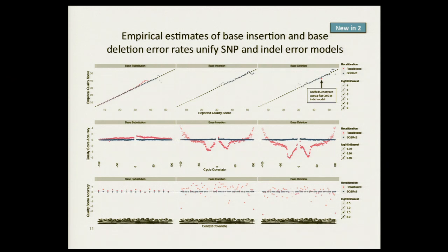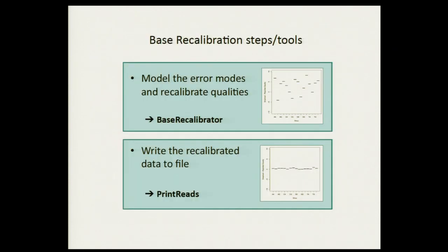Is everyone clear? Okay, so finally, let's go through some command lines. As with most of the GATK tools that you're going to see, it's a 2-part thing, where the first step is you create a model, or you create something, and the second step is to apply that thing.